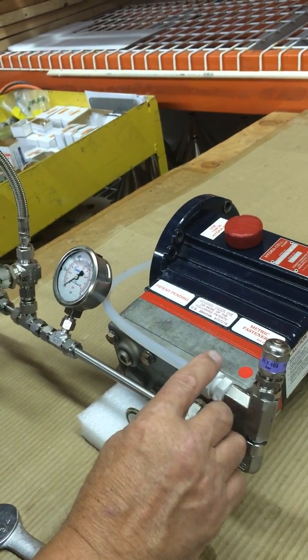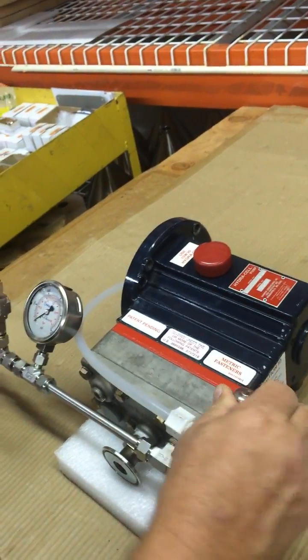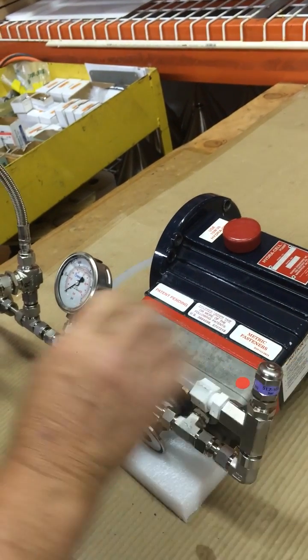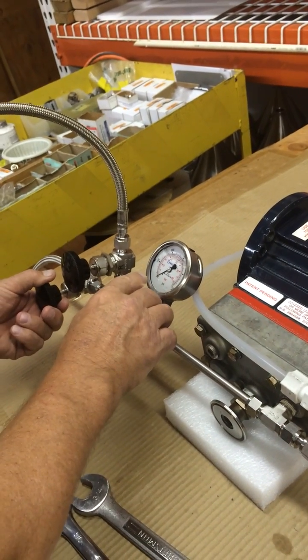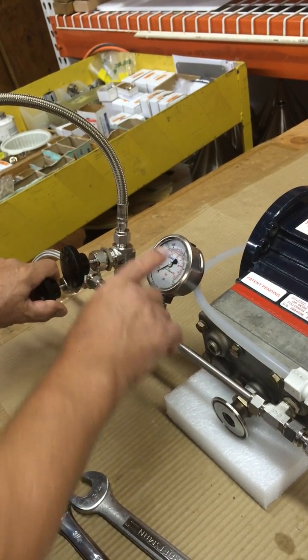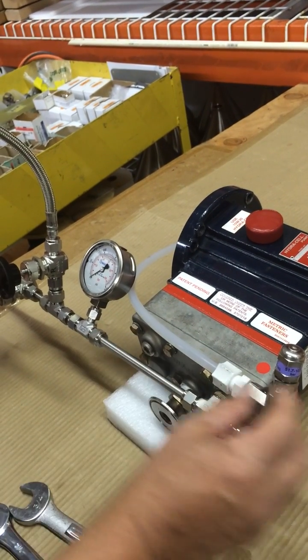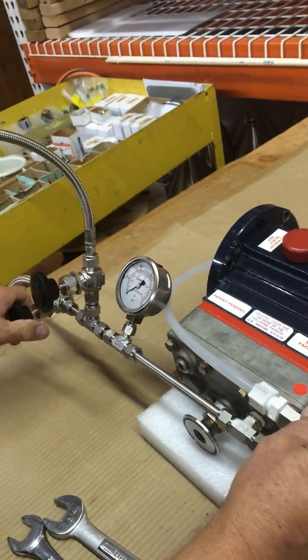To get more pressure — to set the pressure — we turn this up higher, turn the concentrate control valve in, and maybe go up to 300, and then it will bypass again. The spring will let it bypass at 300 psi.